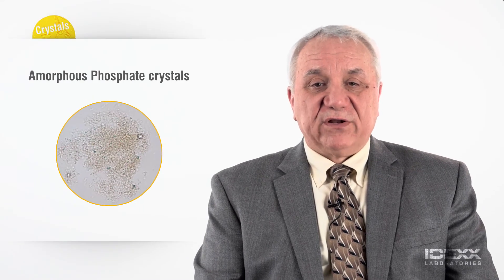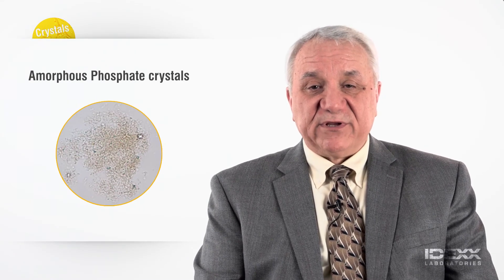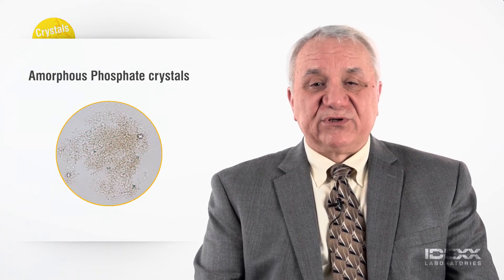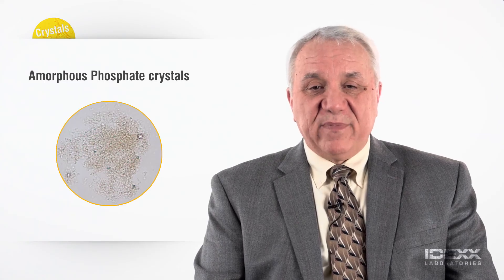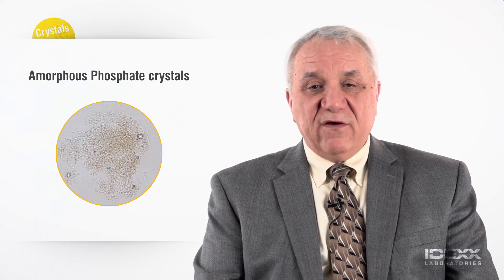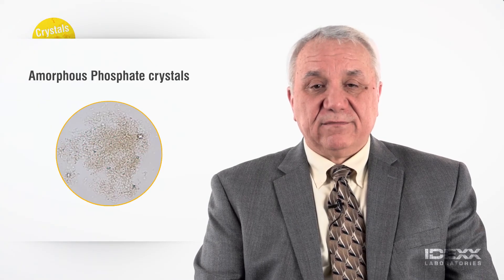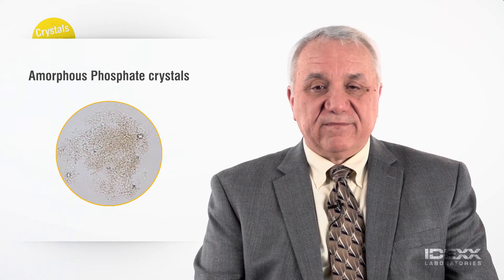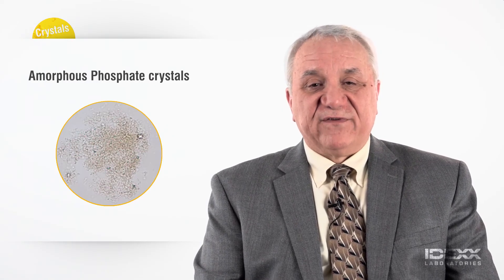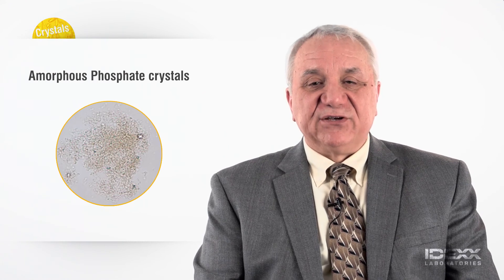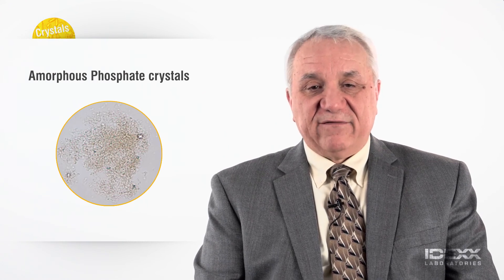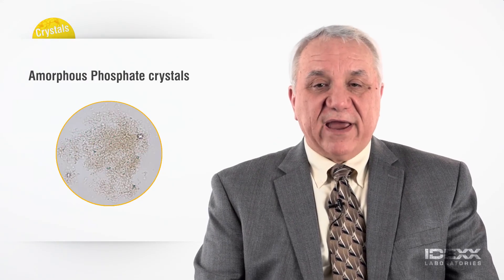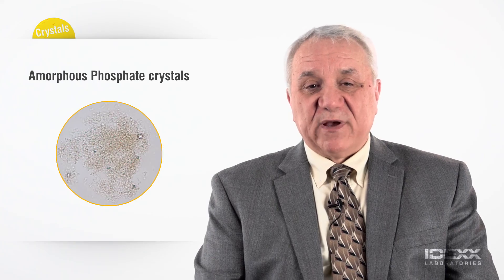Amorphous phosphate crystals are relatively common in alkaline urine specimens and they have no clinical significance. They are described as granular precipitates with no definitive shape, and they are morphologically indistinguishable from amorphous urate crystals. However, amorphous urate crystals are seen in acid urine specimens. The primary importance for amorphous phosphate crystal identification is to assure that they are not misidentified as cocci bacterial forms. This is a great application of the air-dried and stained preparation of a concentrated urine specimen.